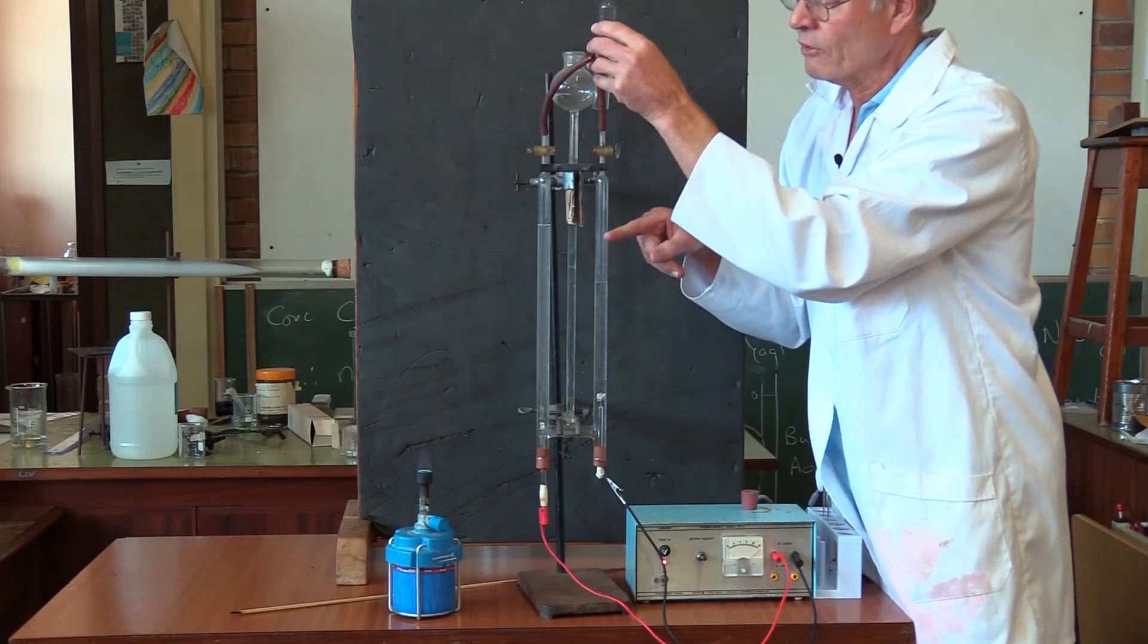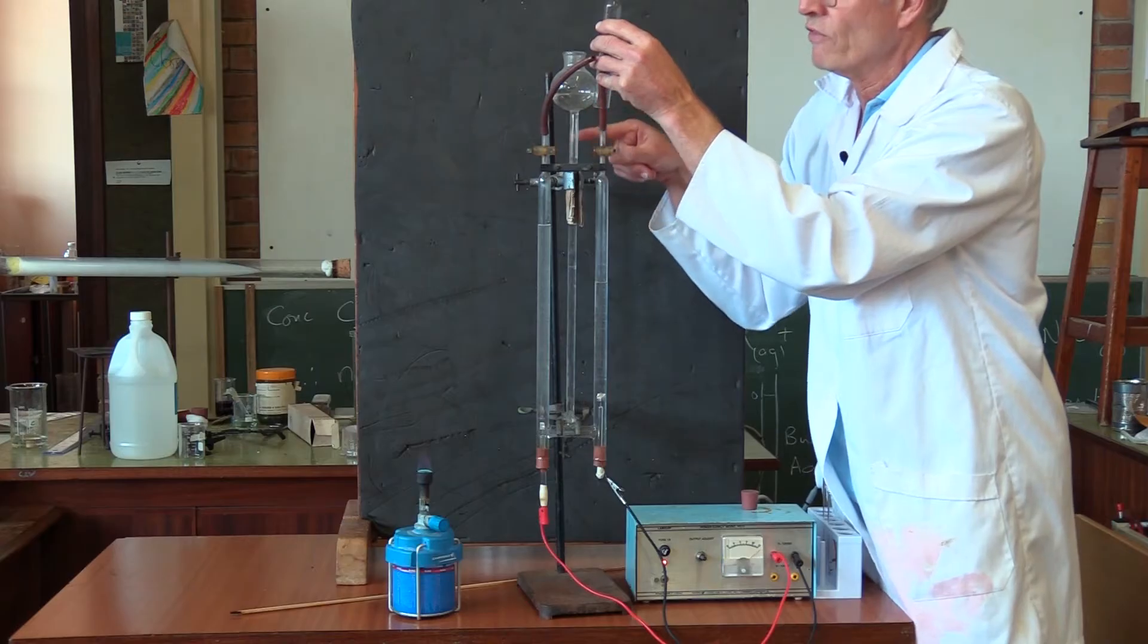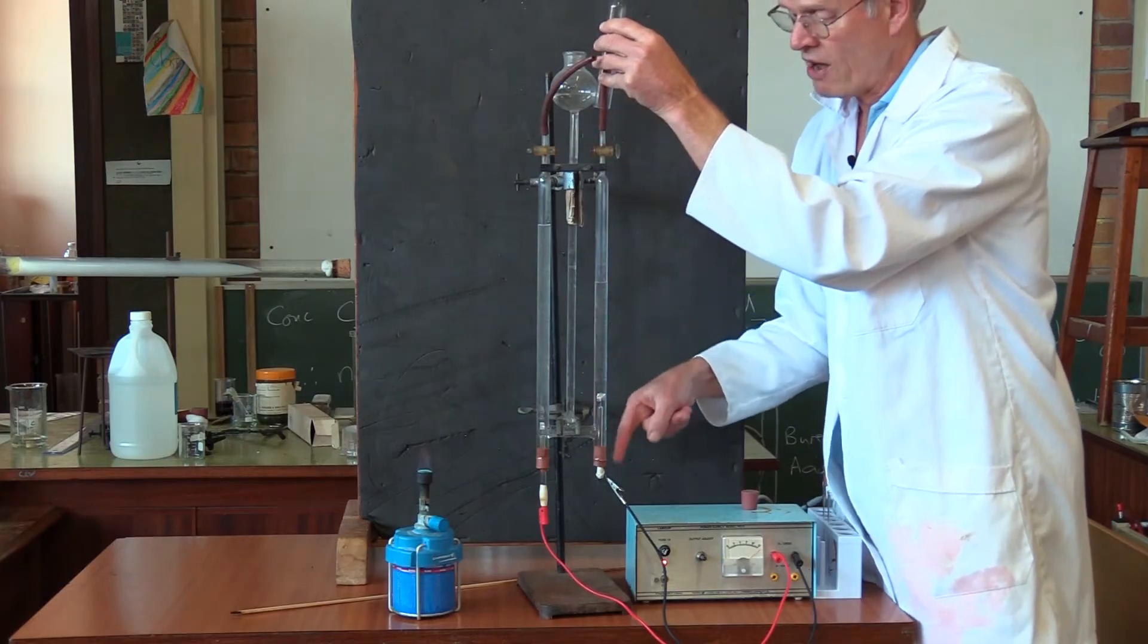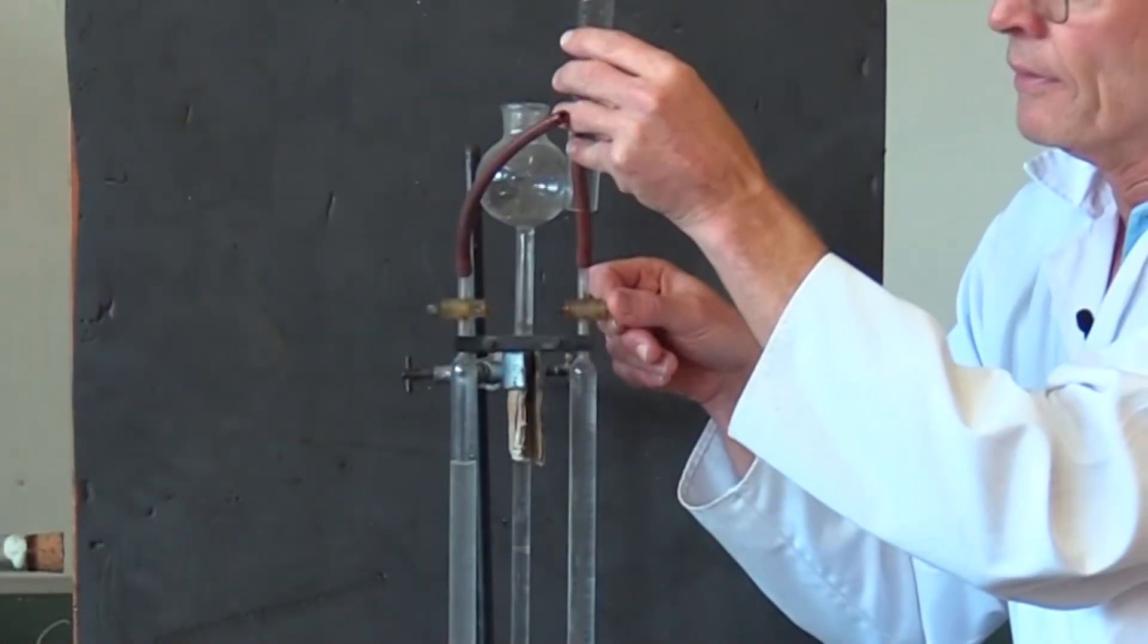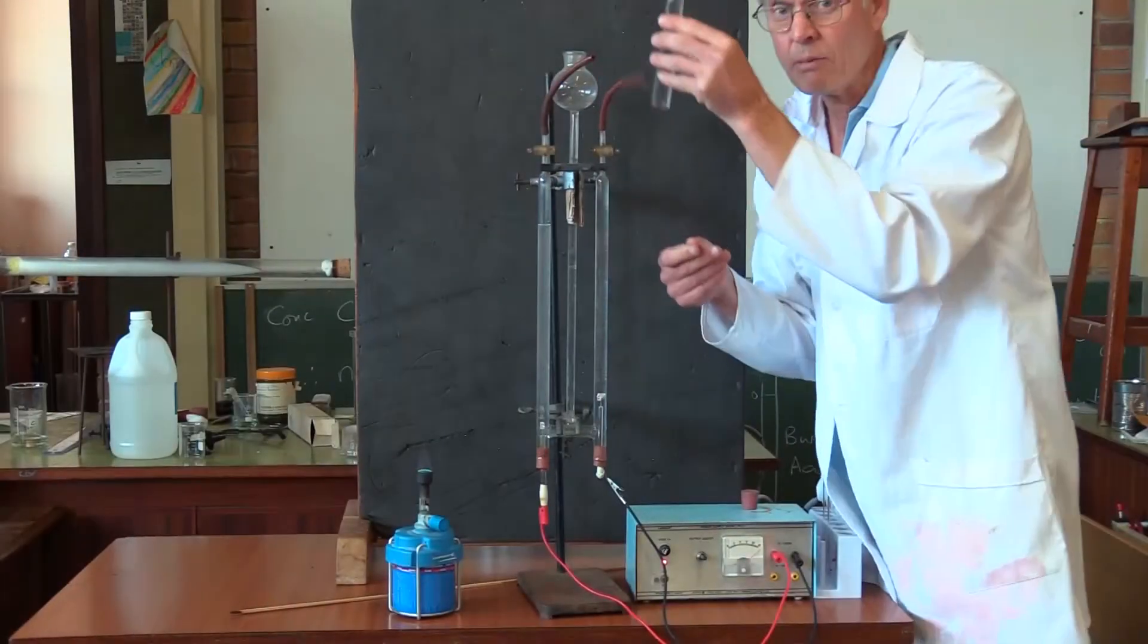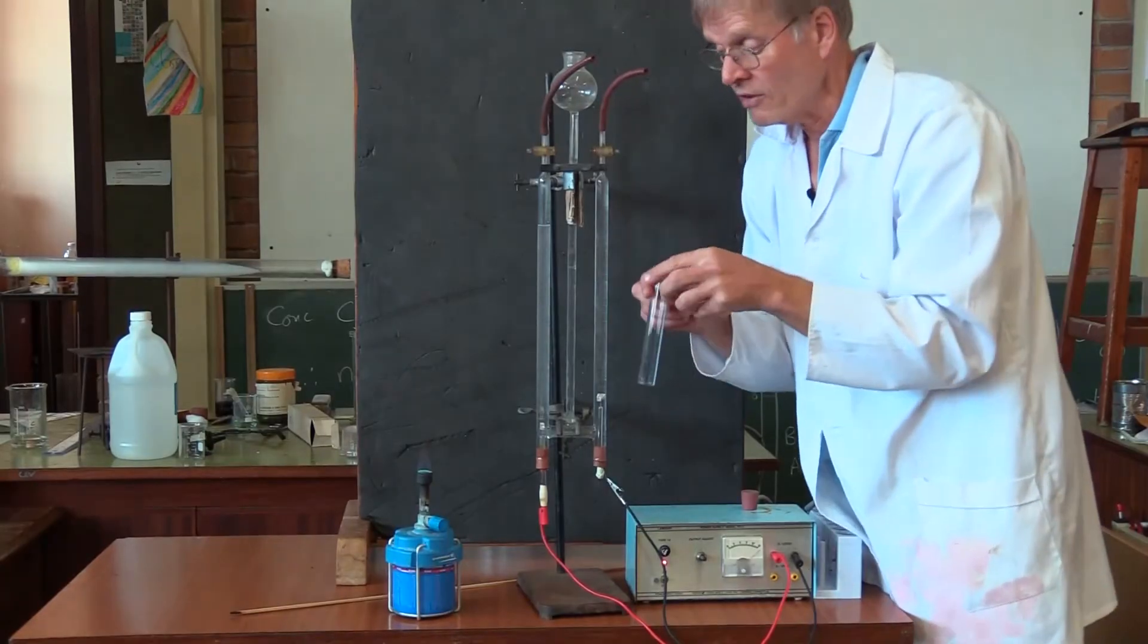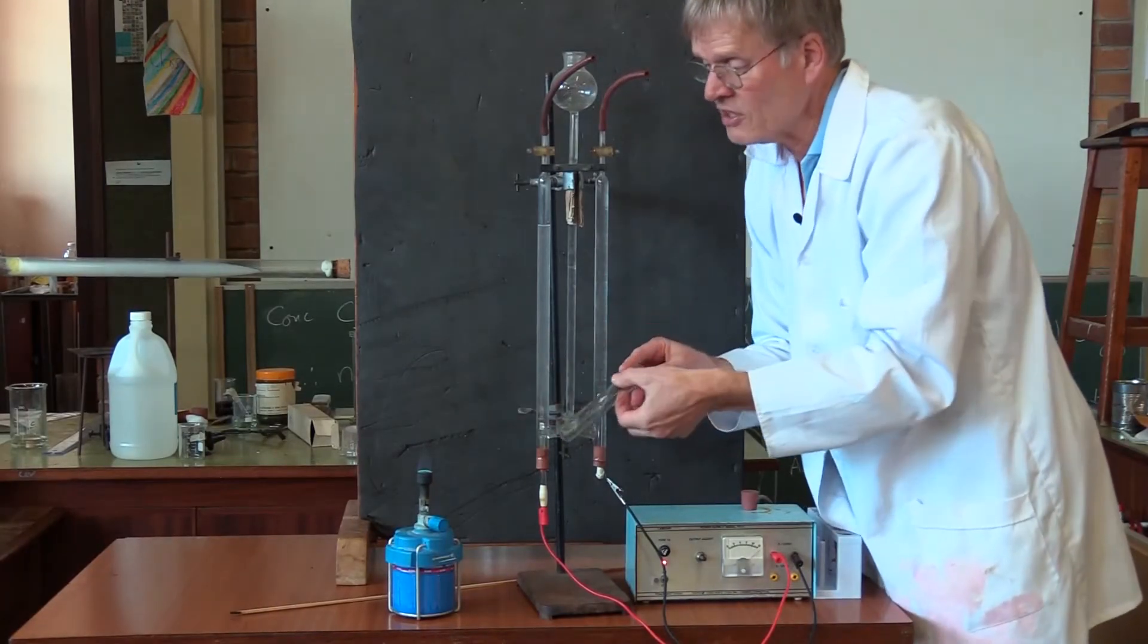and we will see the level of this liquid go up. As the reservoir drops, it pushes down and pushes the level of the hydrogen up. There we go. So this is pretty much full of hydrogen. Now we're going to go and take it and see what happens.